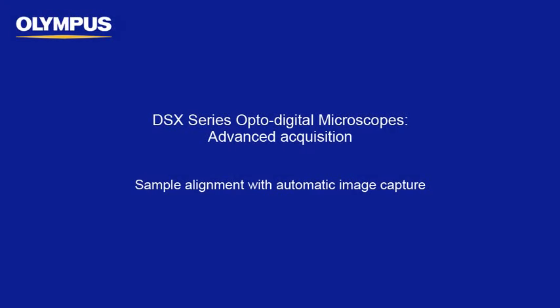This tutorial is one of many instructional videos presented by the Olympus Industrial Equipment Group. This tutorial video will provide you with detailed instructions for setup and operation of advanced acquisition within the Olympus DSX series opto-digital microscopes.